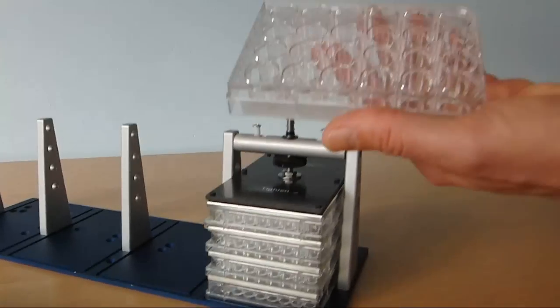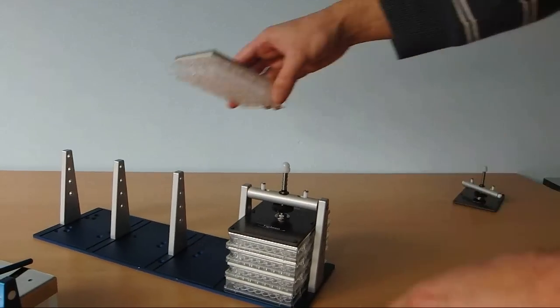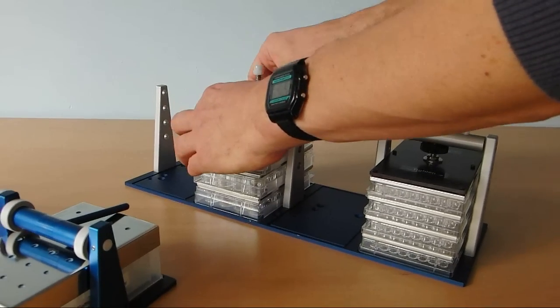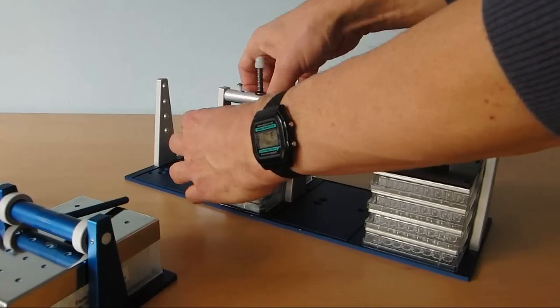The same story for 24 well plates, with the sole difference that only three plates plus covers can be stacked in one position, because these microtiter plates are higher.